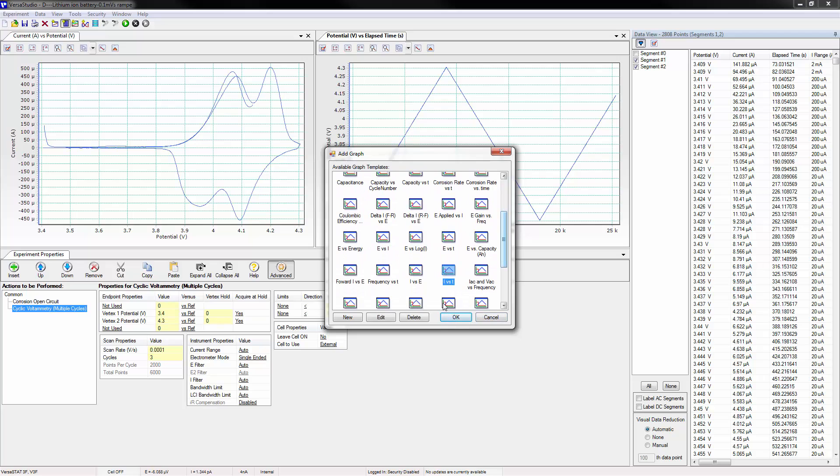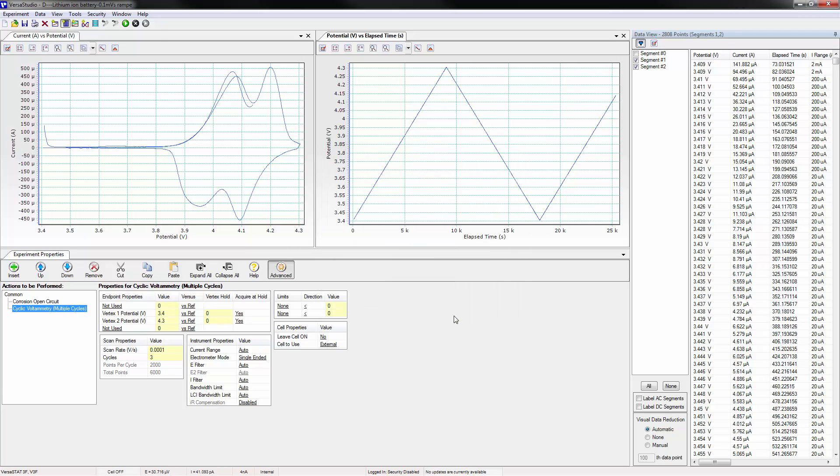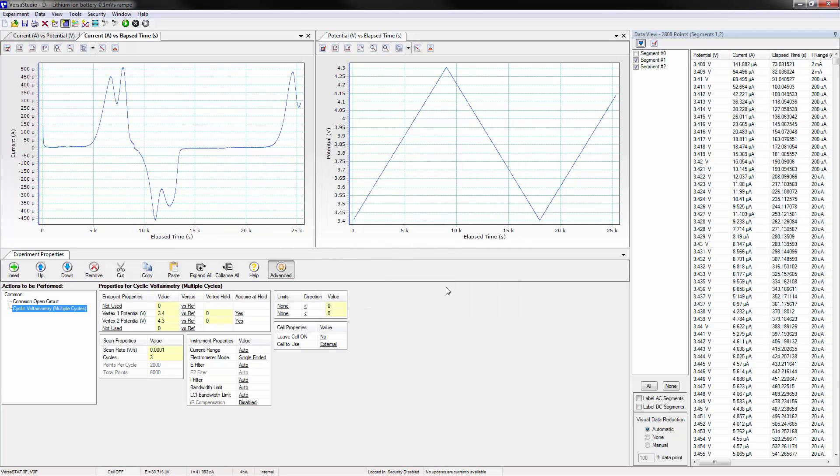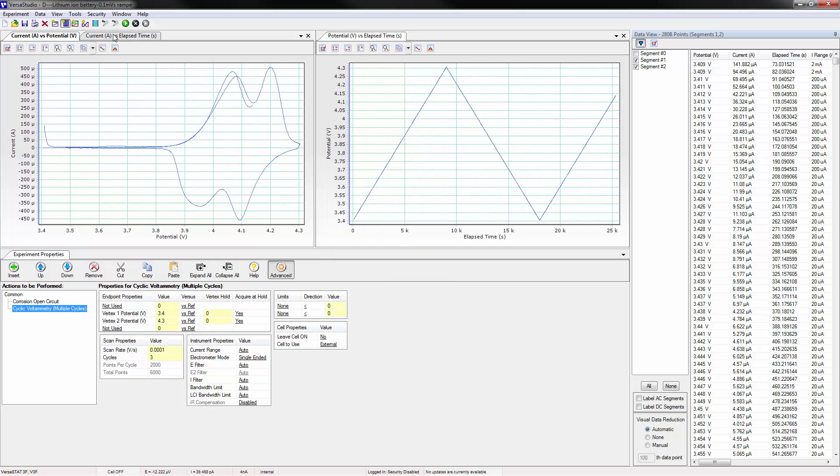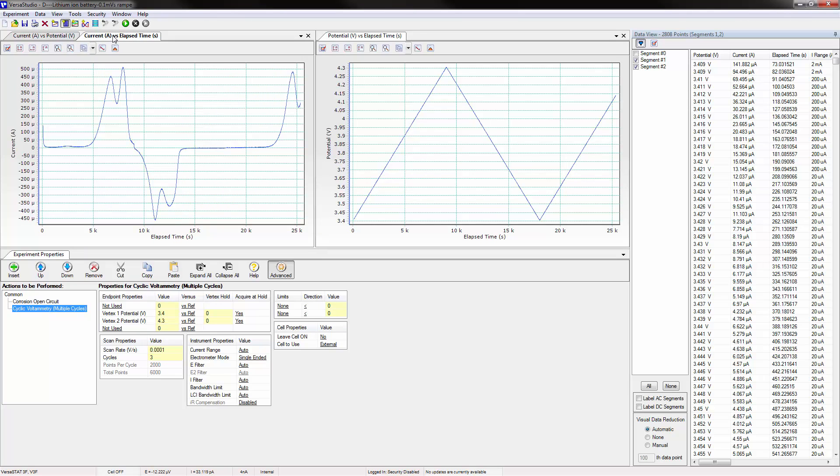If another graph is added, it will again default to the original graph window accessible by its tab. It can also be docked as shown before.